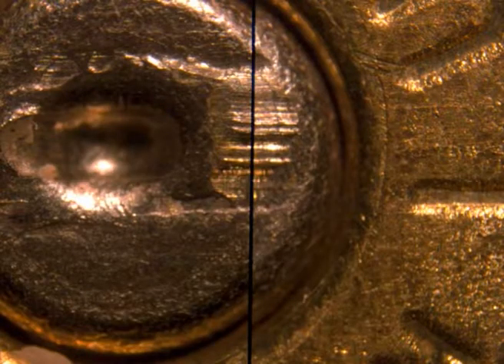However, modern instruments are now attached with a closed circuit television, which you call CCTV, and a monitor connected to an additional video recording device. With this type of assembly, it is now possible to record the striation marks around the whole of the circumference of a bullet. This figure on your screen shows the photography of two cartridge cases during striation matching.